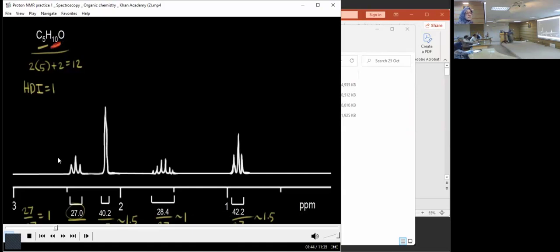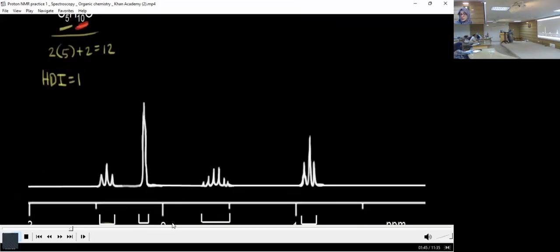So if we multiply 1... Yeah. You can make it full screen. Because when I make a full screen, you will not be able to see. Can you please insert? Nothing is happening. I'm doing this, but nothing is happening here.